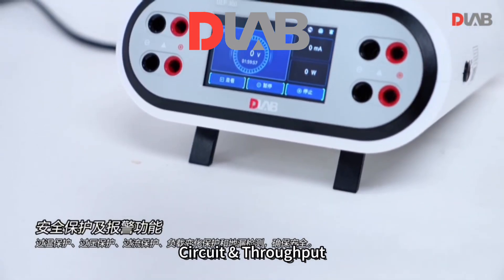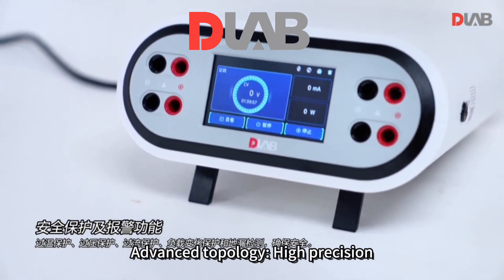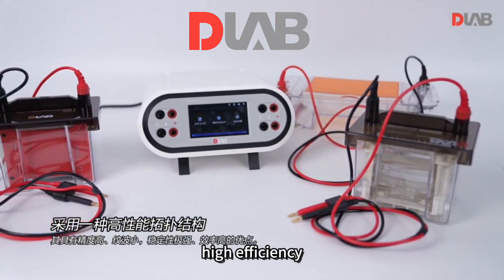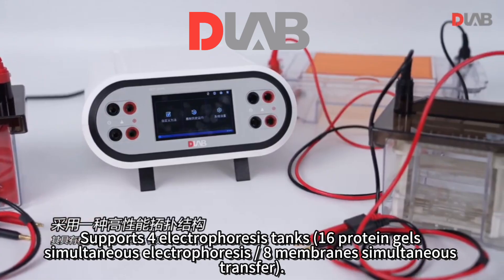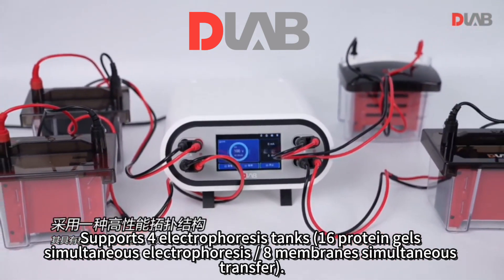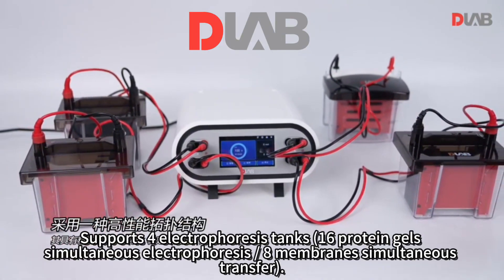Circuit and throughput: advanced topology, high precision, low ripple, strong stability, high efficiency, and high throughput. Supports four electrophoresis tanks, 16 protein gels simultaneous electrophoresis, and eight membranes simultaneous transfer.